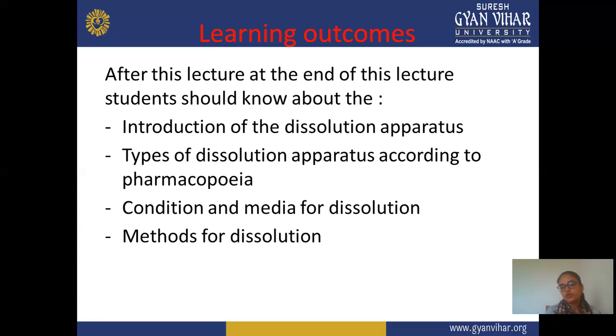USP, BP, and IP, and the conditions in media for the dissolution, because every formulation requires different conditions or different media, maybe some temperature changes, pH or buffer changes. So you should know complete information regarding these conditions in media for dissolution. Next is the method of dissolution, meaning how we perform this dissolution test, or the different methods for dissolution. So this is about the learning outcomes.